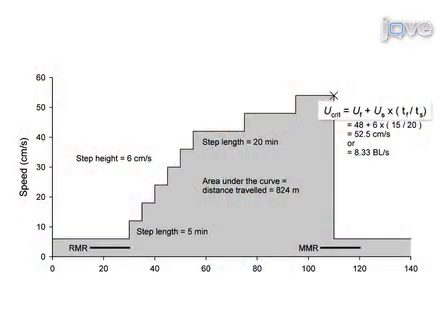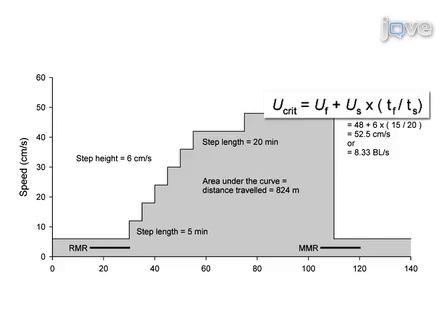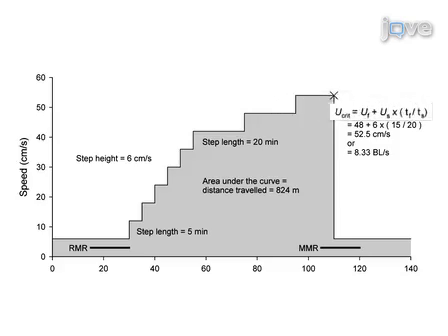In the step test, the traditional way to report the maximum speed achieved is to calculate the speed of the last fully completed step plus the temporal fraction of the last final unfinished step. The equation seen here is used to estimate prolonged or sustained swimming ability, also referred to as critical swimming performance, or U-crit. The cross indicates the point where the fish refused to swim further and where U-crit was calculated.